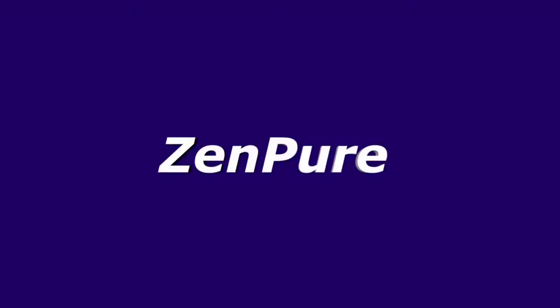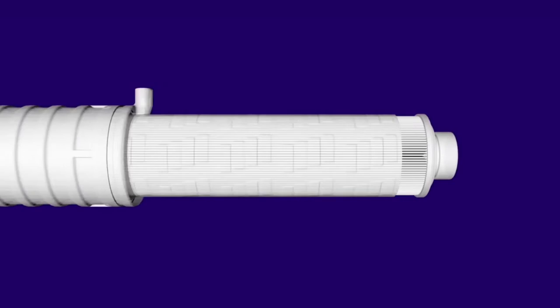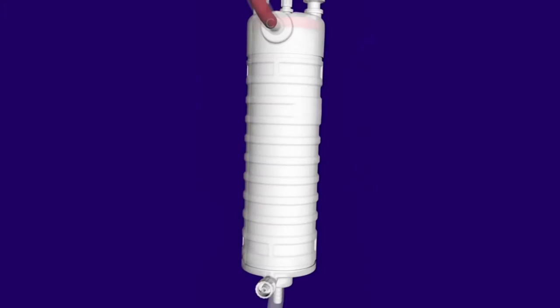Biopharmaceutical processes often clarify or sterilize therapeutic fluids using microporous filter cartridges enclosed within a capsule. After the fluid has been filtered, these single-use capsules retain a volume of liquid within the filter membrane and inside the hollow core of the filter cartridge.